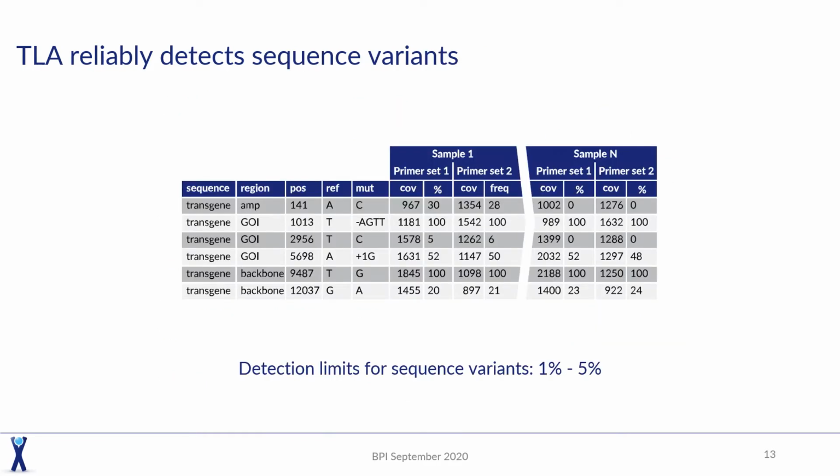Importantly, also for looking at transgene integrity, we can immediately see with this technology, because we cover each position thousands and thousands of times, any single nucleotide variants that might, of course, affect your eventual biological. So we can exactly determine where in your transgene or vector, in your gene of interest for example, the position of the mutation is, which mutation we observe, and we always use two data sets that will independently call all the variants.